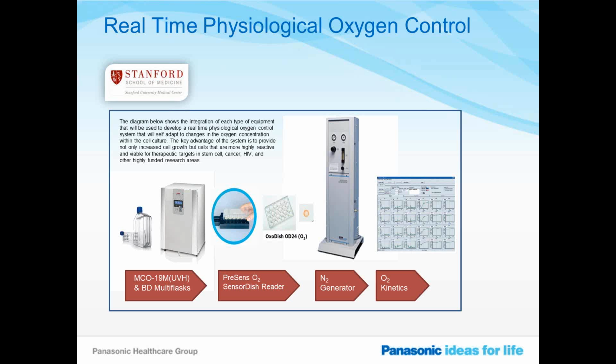And there could be some big advantages, maybe even in terms of savings, cost-wise, to going with this model. But we will be presenting the data on this real-time physiological oxygen control.